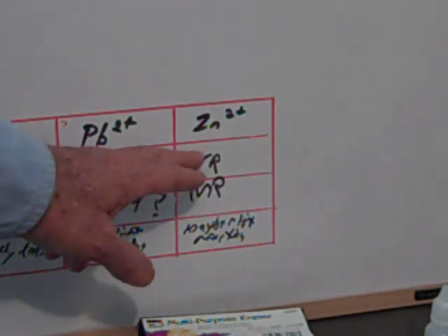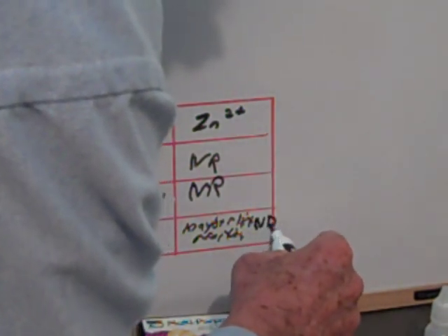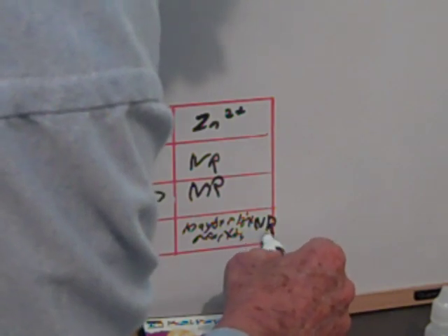And on the last set of samples, we have no reaction with the copper, which we should have had. No reaction with the lead, finally, which we should have. And maybe a tiny little bit with the zinc, and that shouldn't have happened either. So, you know, this is largely no reaction. So the zincs are probably okay. I mean, that's figuring backwards, but we have exactly what we expected to happen, except for the lead, which darkened on the lead nitrate solution. Right now, I have no idea why that occurred.